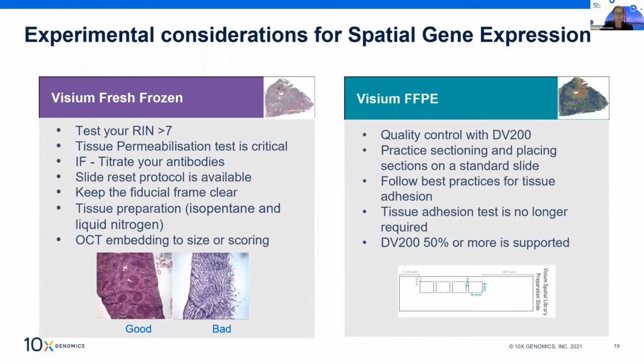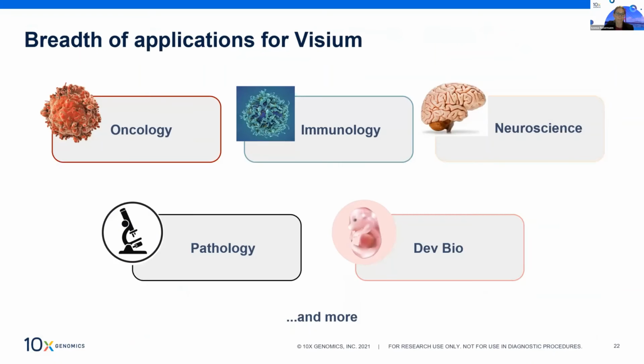We have removed the tissue adhesion test slide as a necessity up front, but please follow the best practices for tissue adhesion in this workflow. And for fresh frozen, there are a few guidelines around sample storage and sample embedding as well.